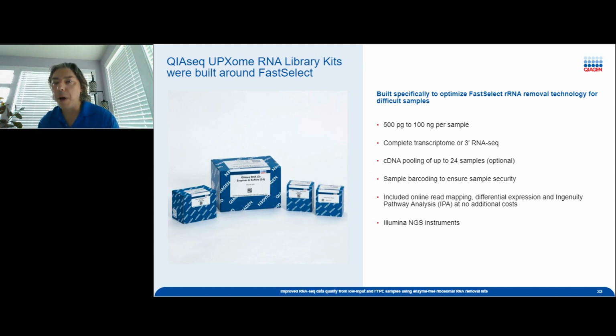One of the things to keep in mind is that the RNA library construction that you choose is often based on the amount of RNA or cDNA at that point that you have in your sample, and that you may need to dilute the adapters more or add a couple more cycles to the amplification step, because we find we're removing a lot more of the ribosomal RNA, or in the case of globin, it's completely disappeared.